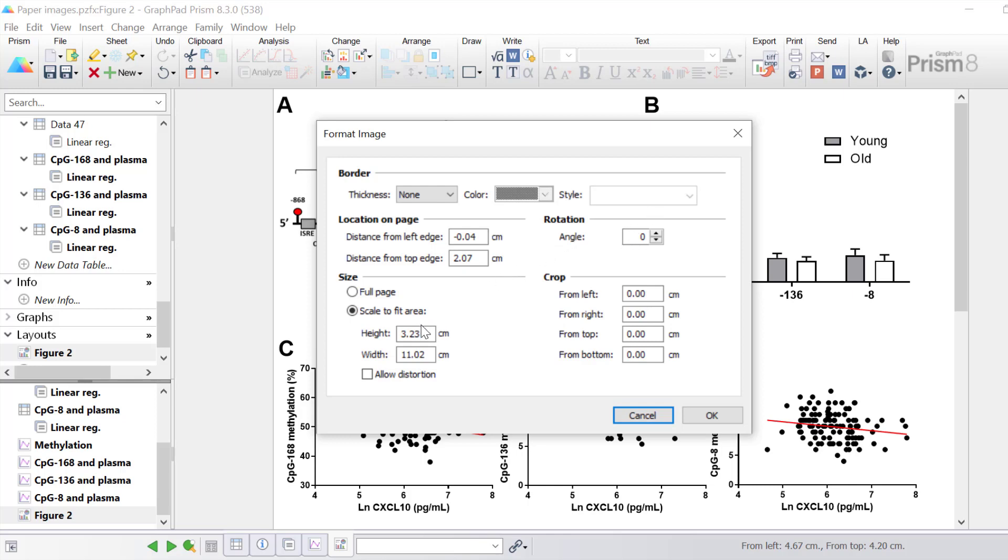You can change the scaling of the image. Prism will keep the same image ratio. However if you want to change the height and width independently you have to click the allow distortion option and then you can change each value independently.